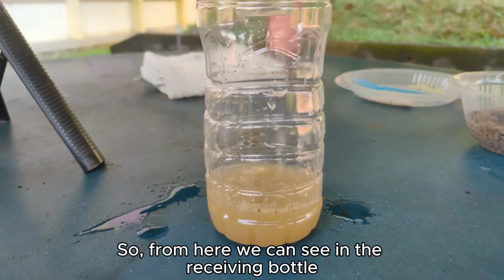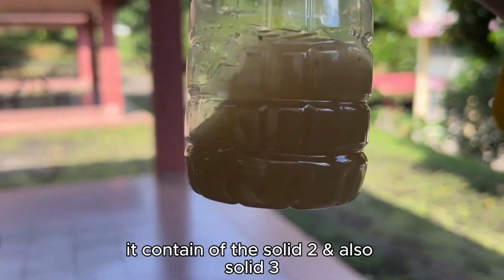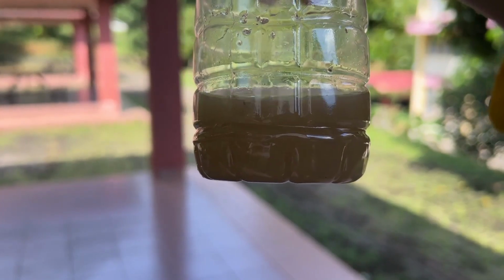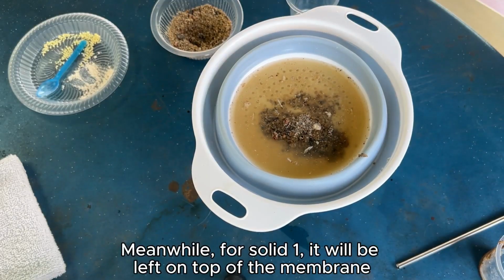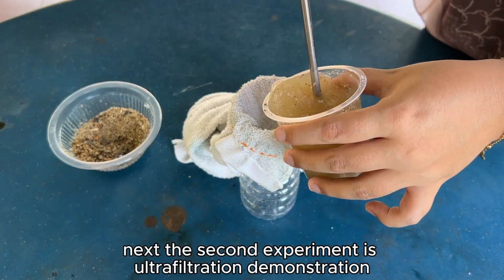So from here, we can see the receiving bottle contains solid 2 and also solid 3. Meanwhile, solid 1 will be left on top of the membrane. Next, the second experiment is the ultrafiltration demonstration.